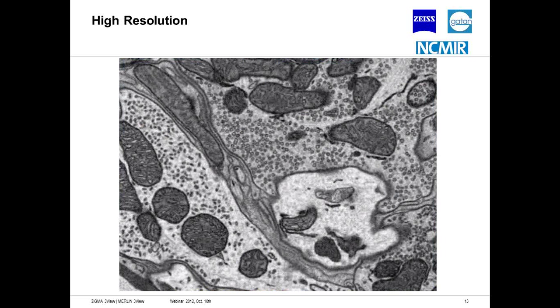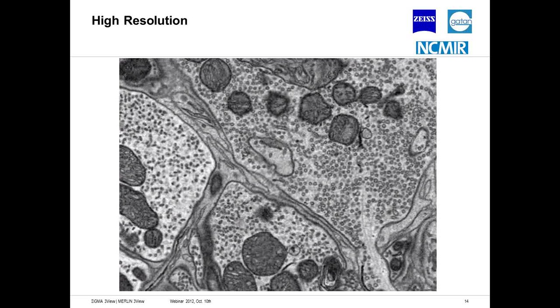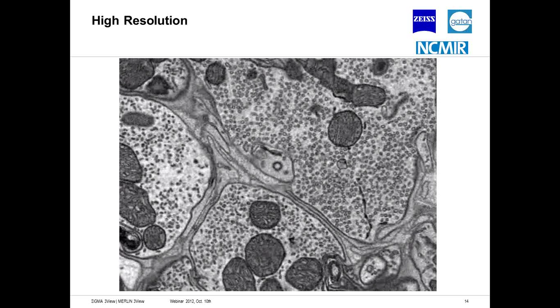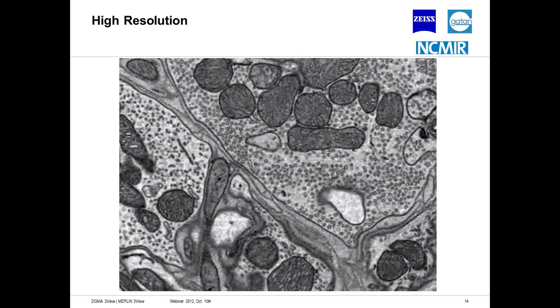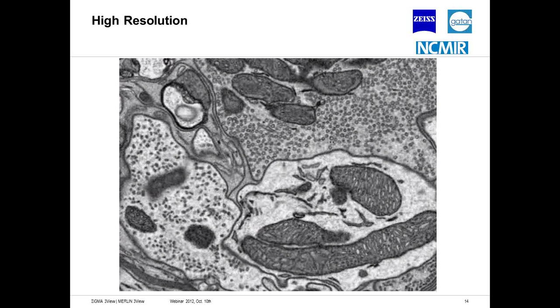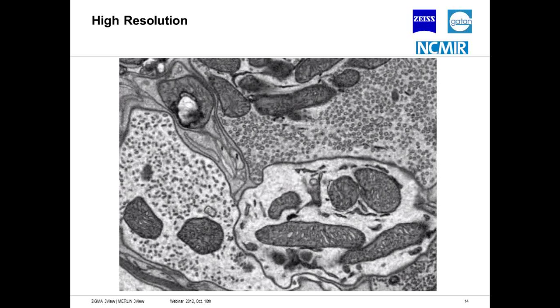So why do we do EM? I think EM has always been one of the imaging techniques that's a fallback. A lot of my experience with working with individual researchers is they would submit a paper, and the paper would get conditionally accepted if they could prove X, Y, and Z with a couple of electron microscopy images. And no one in the lab knew how to do electron microscopy, so they would come visit us.